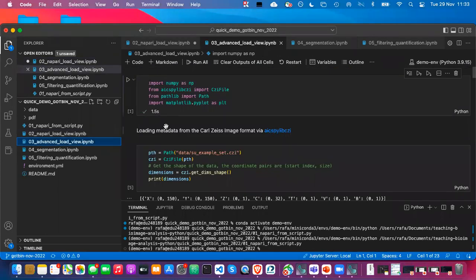All right. Just in case people didn't ask, there was a question here, if you could not listen, because I think the audio is connected to my machine. There was a question about how to export images, and yes, you can export images from the viewer.